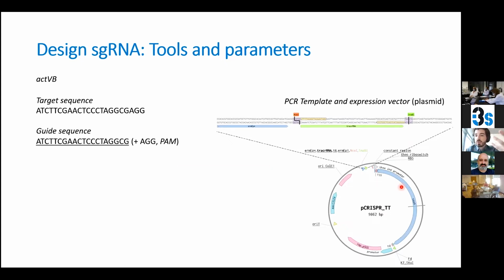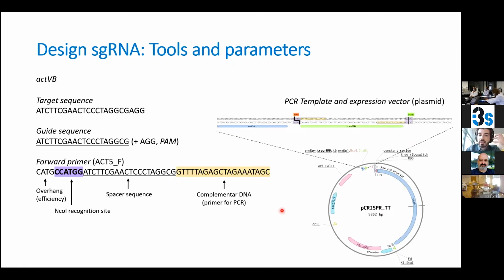How do we clone? So how do we clone our spacer, or do we paste our spacer sequence, our guide sequence, upstream? So right here, upstream, the green. We are basically going to do this with a PCR. Okay, so basically a polymerase chain reaction in which we are going to amplify the DNA. The trick here is to include, so I should have included here maybe a slide with the concept of PCR. I hope you are more or less aware of it.